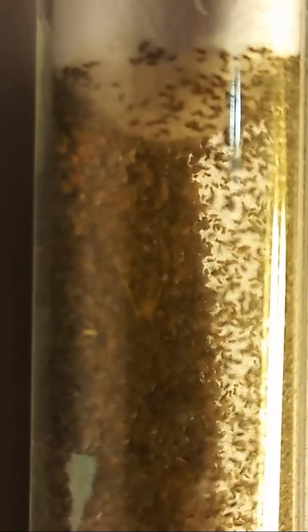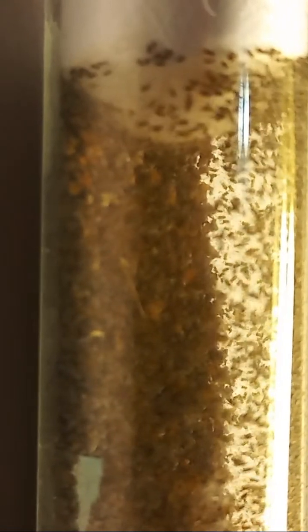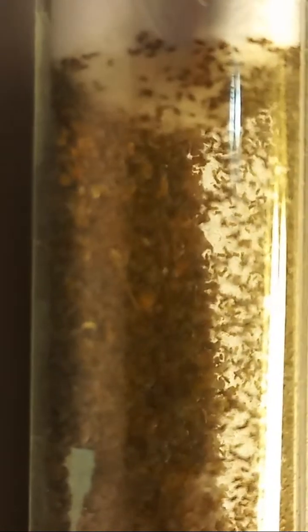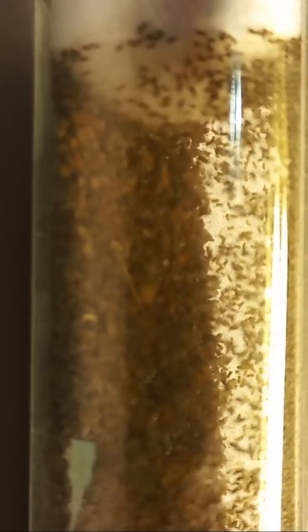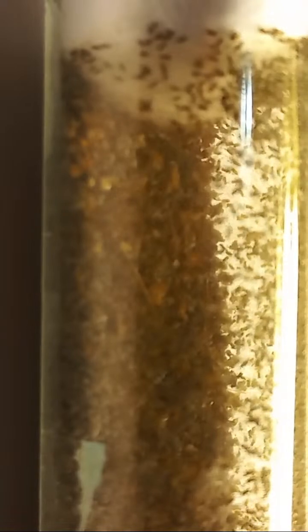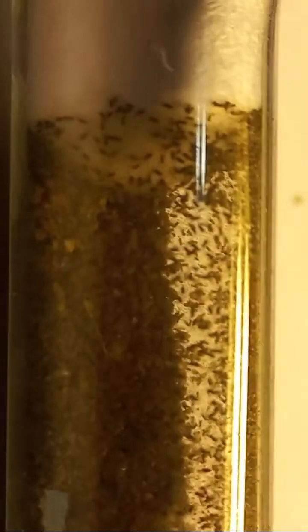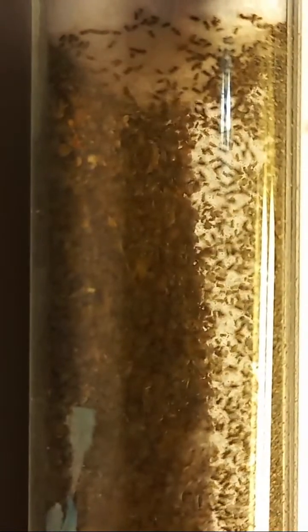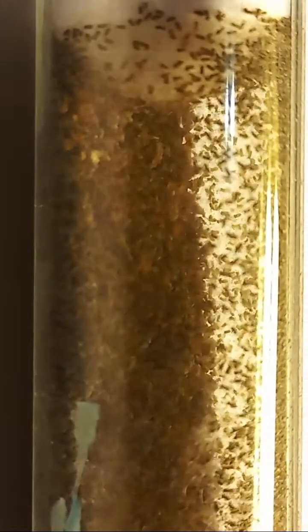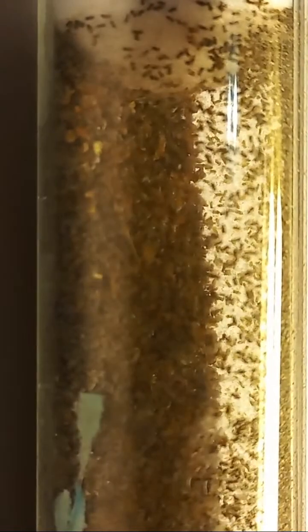And it's quite useful to use natural hosts just received in the natural environment, propose them to these tiny insects and take a photo of their behavior, because they are very happy to crawl around the fresh eggs, like a fresh food, and infest them immediately after such a proposal of new food for infestation. And then it's possible to receive more individuals from infested eggs, so to get some number of eggs.